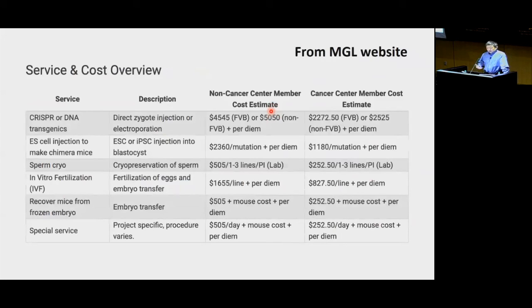The electroporation from the mouse genetic lab point of view is very simple. Avoid injection. It's very efficient. But injection is not, let's say, a big deal. We can do the injection, and it works very well. So for 1 kb or maybe 2 kb or less, go long single-strand DNA, you still need to design the guide RNA. Usually guide RNA is very efficient.